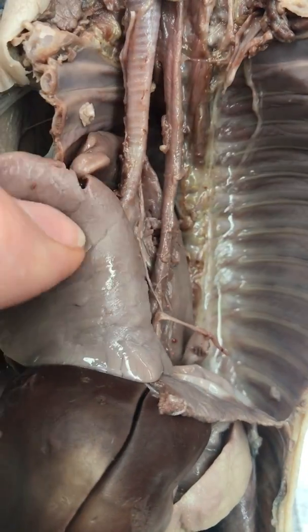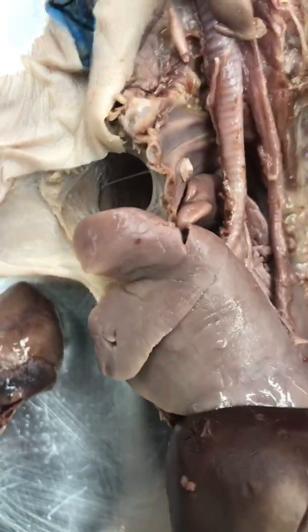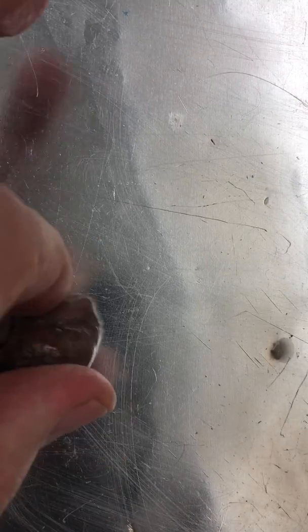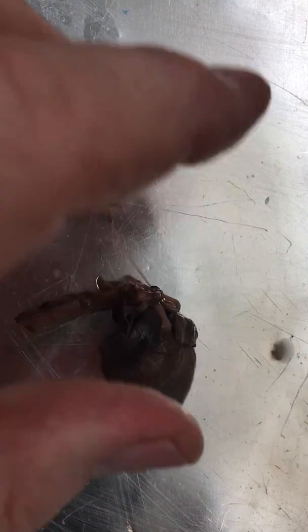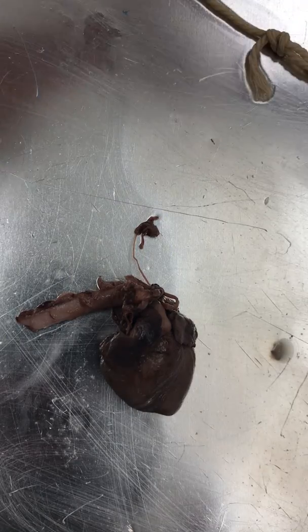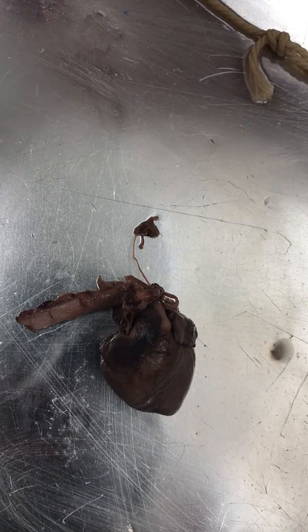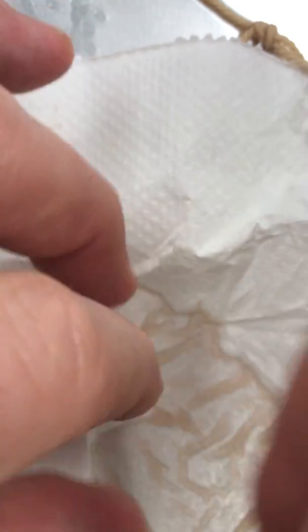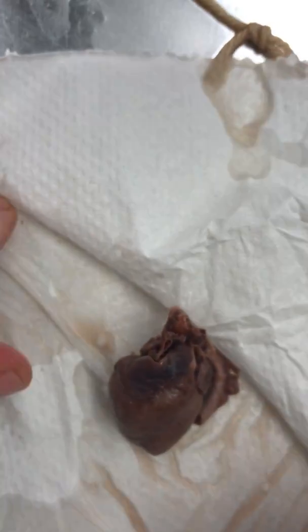All right, so let's look at the heart. I'm going to take my pig out of the pan here. That's not a good background to look at. Let's put it on a piece of paper towel. All right. Let me get oriented here. Things look different when it's outside the body. Okay.